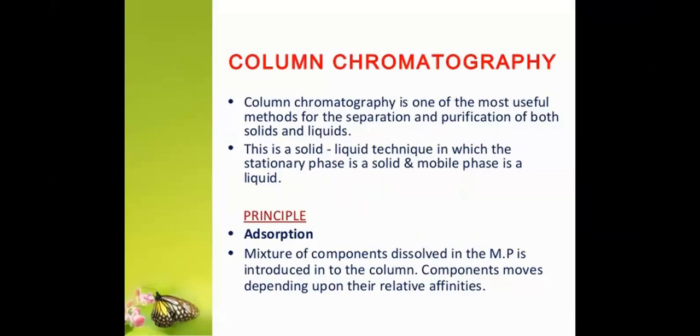So in column chromatography, separation as well as purification of solids as well as liquids can be done. Separation as well as purification means it can be used for qualitative analysis and also for quantitative analysis, with the help of the stationary as well as the mobile phase.